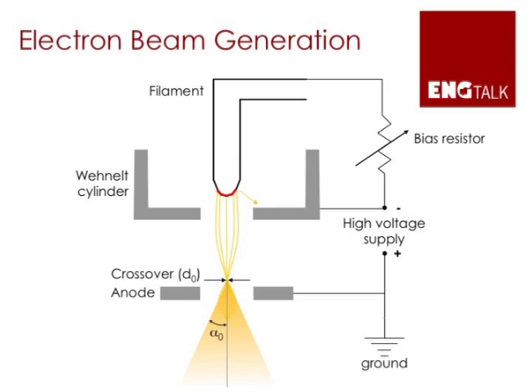Before I get into that though, I'd like to describe how we generate electrons, and then how we shape the electron beam to interact with the sample. To generate electrons, we use something that's similar to an incandescent light bulb. We take a tungsten filament and run a high current through it, and then the electrons start to boil off of the surface. And through some electronic circuitry attached to the gun, the so-called gun of the electron microscope, we focus that electron beam and inject it into the electron column.